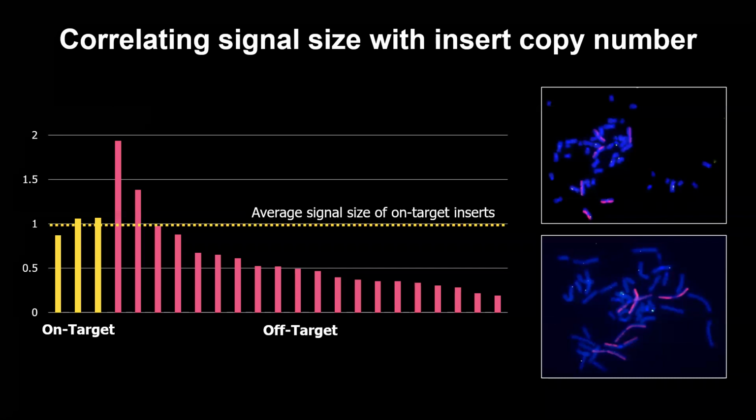One of the potential applications for Insight probes is to confirm copy number at each integration site. So our development of this capability is ongoing, but it at least appears from relative fluorescence that many of the off-target integrations observed in these edited iPSCs are partial transgenes. As I said, we are working out approaches to qualifying this assay as a means of determining copy number, and there'll be more on that soon.